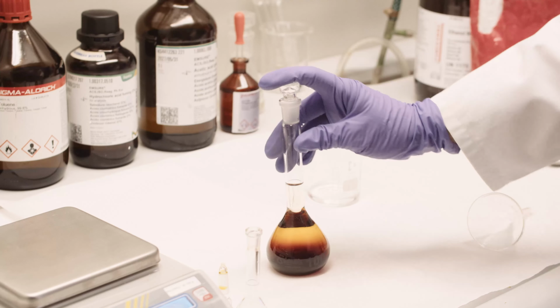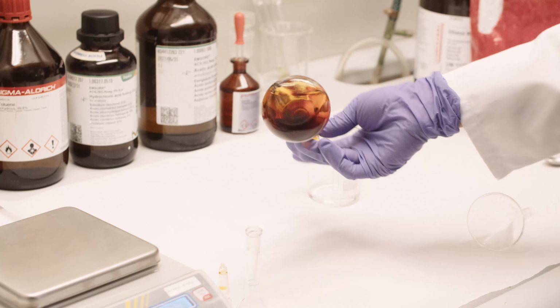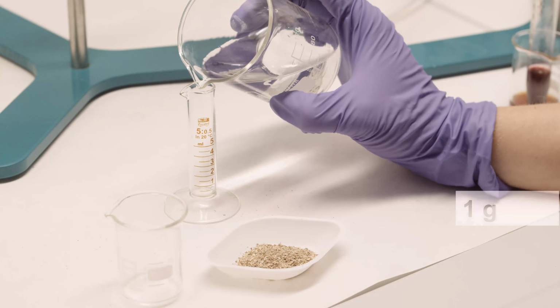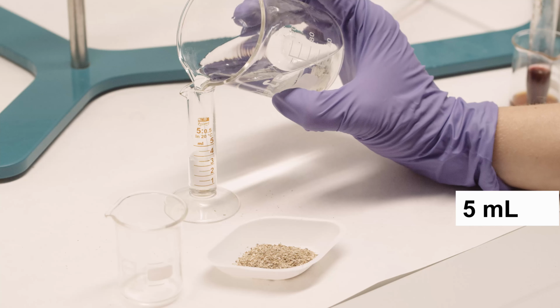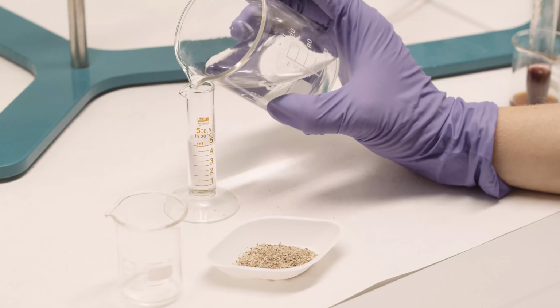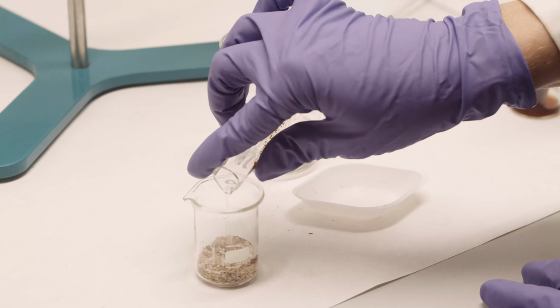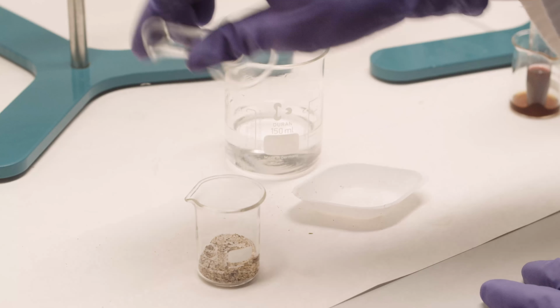The chemical test for the presence of polysaccharides in Iceland moss is carried out by first pouring 5 milliliters of water over 1 gram of the powdered drug. In this case, we do not heat in a water bath, but directly on the heater, since the water must boil. We get a grayish solution that solidifies when cooled.